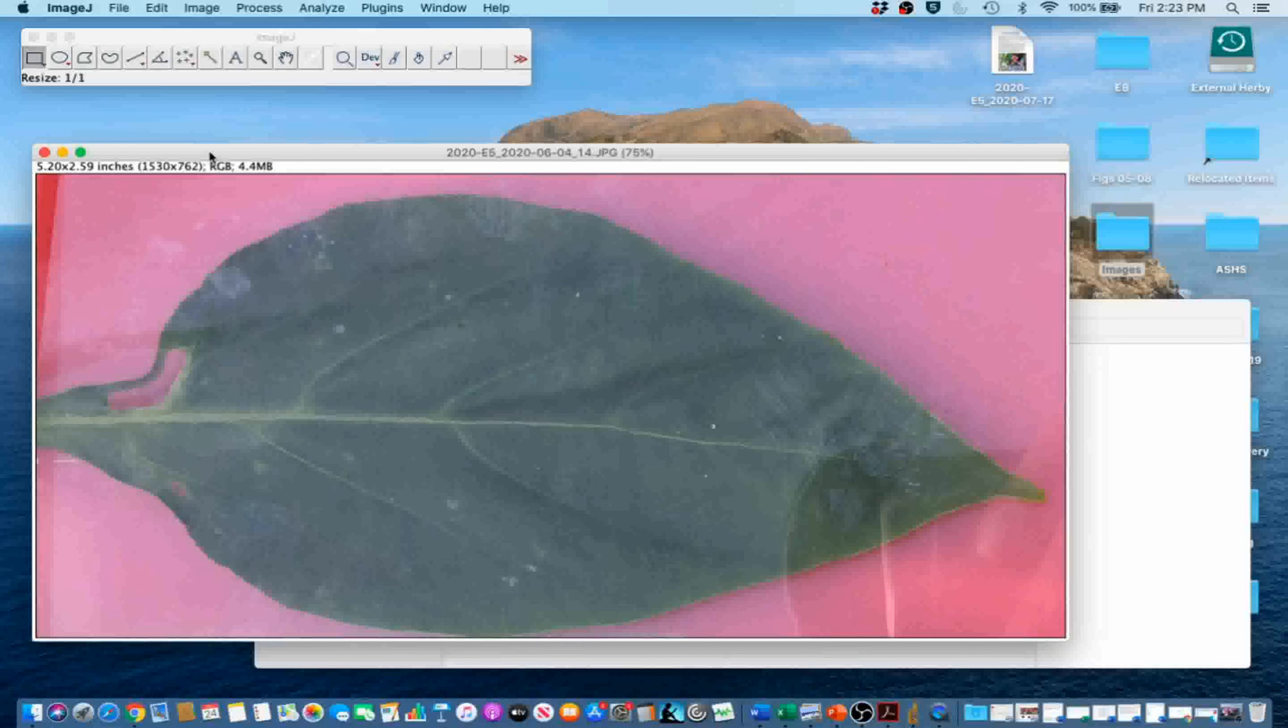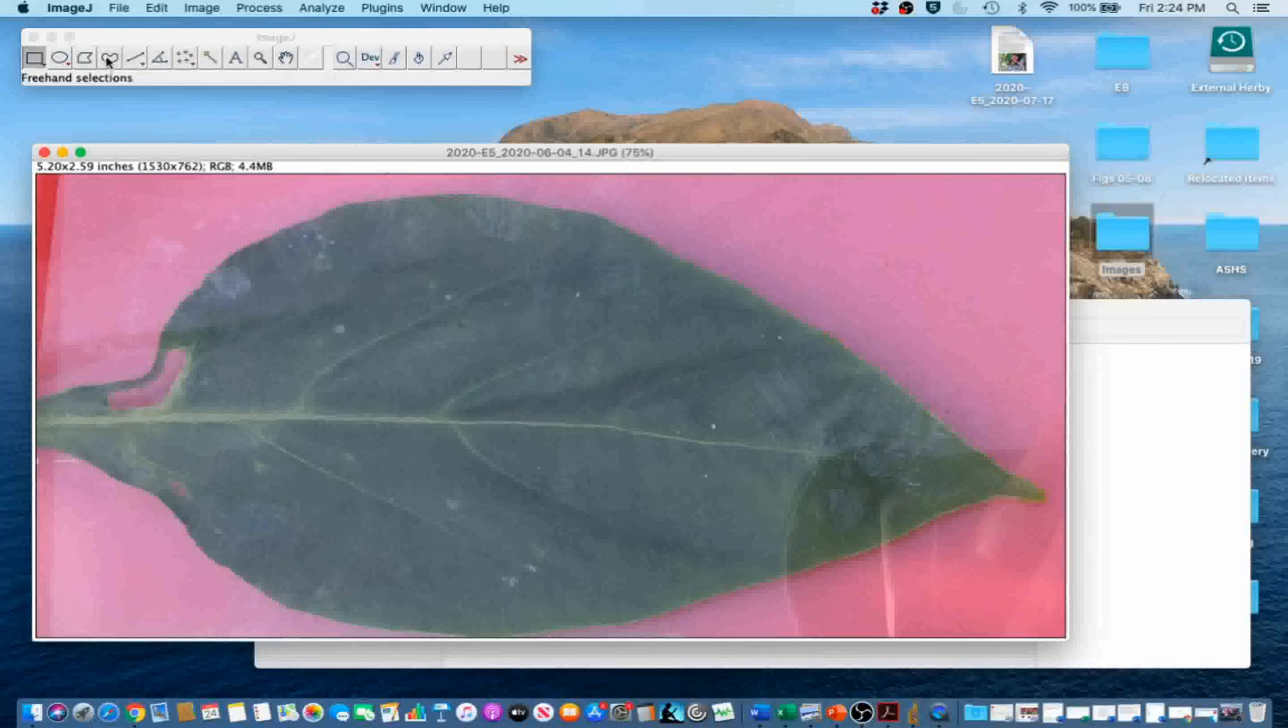The magnet should be excluded from the cropped image because its hue and brightness are similar to those of the leaf. If it is impossible to exclude the magnet with the rectangle tool, you can go ahead and use the freehand selection tool instead.